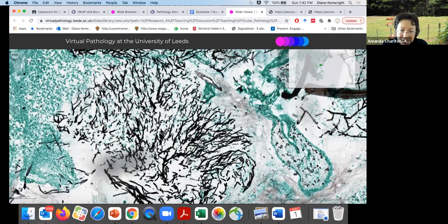And then what sort of fungal hyphae? Are they acute angle or wide angle? I'm just looking. I can see 45-degree angle branching going on here. They're coming out and then they branch and they branch and branch. So dichotomous 45-degree angle branching. Well, looks like Aspergillus to me.